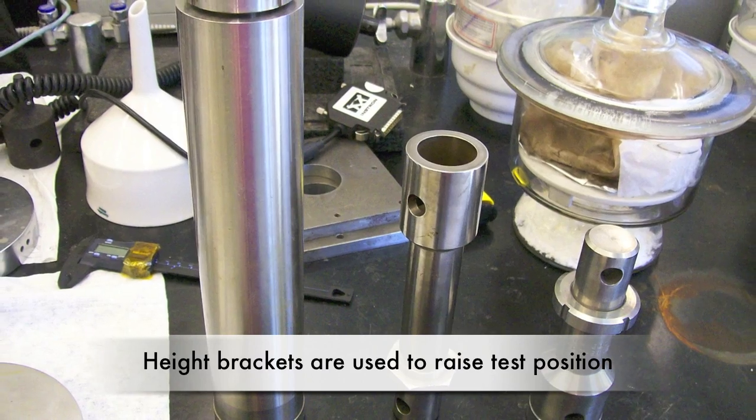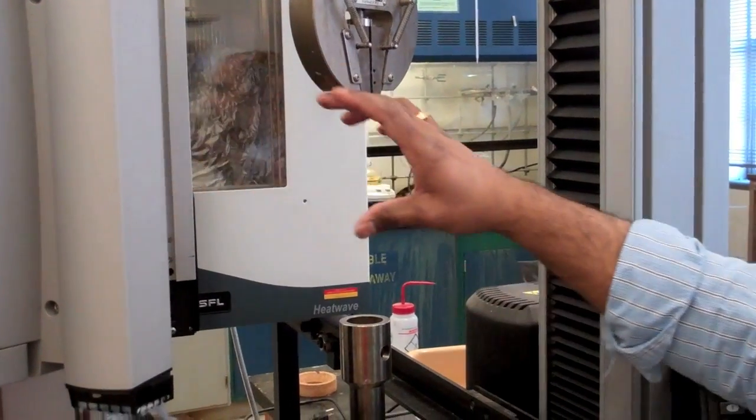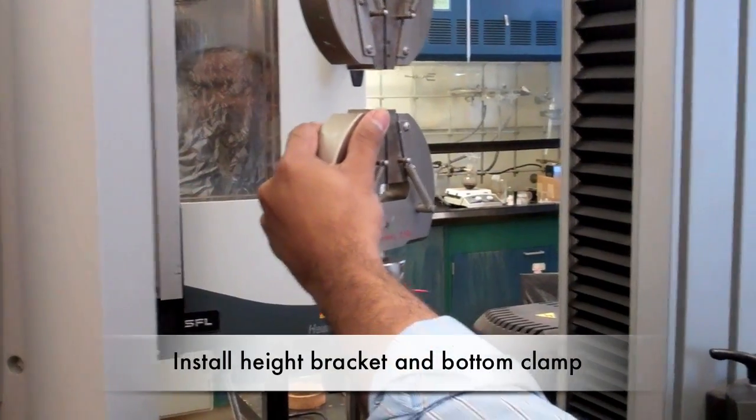Height brackets are used to raise the sample. The height change is needed to hold the sample at the level of the video extensometer. The brackets can be added with a pin along with the bottom clamp.